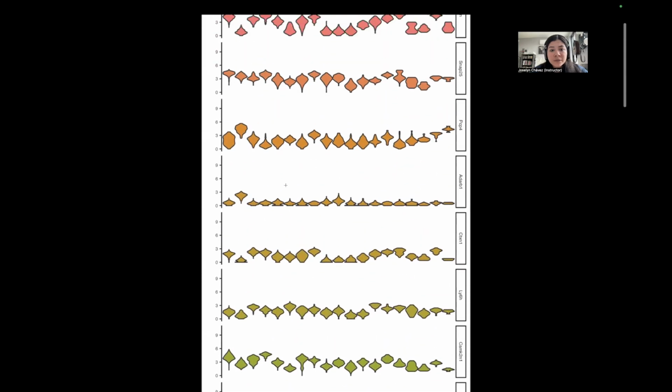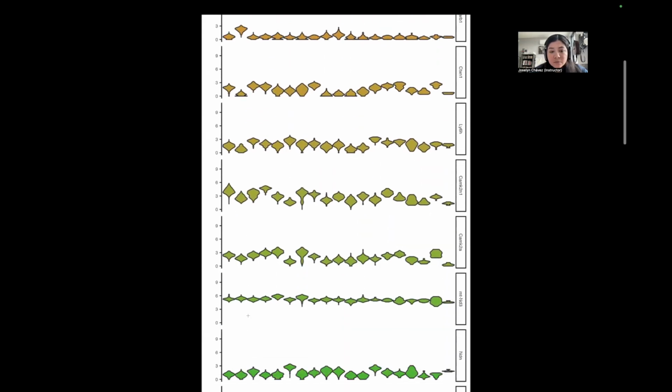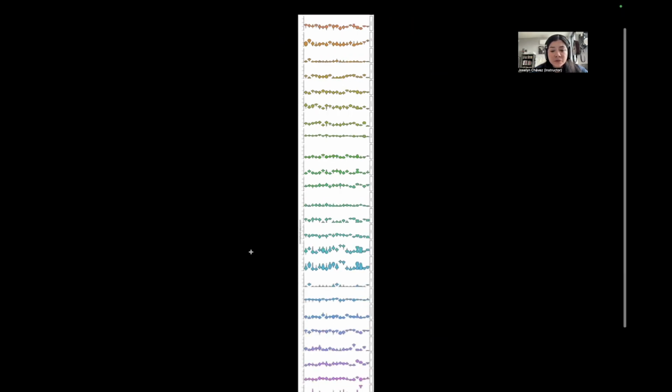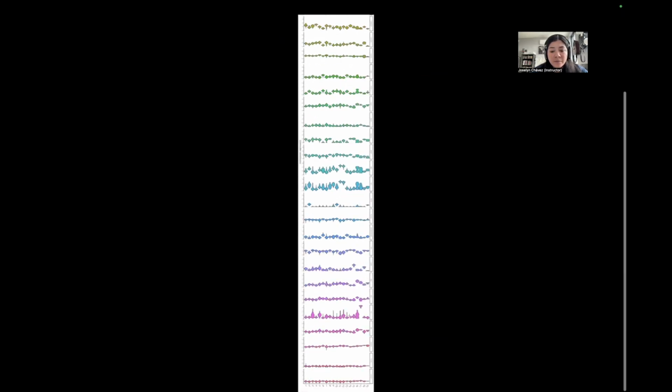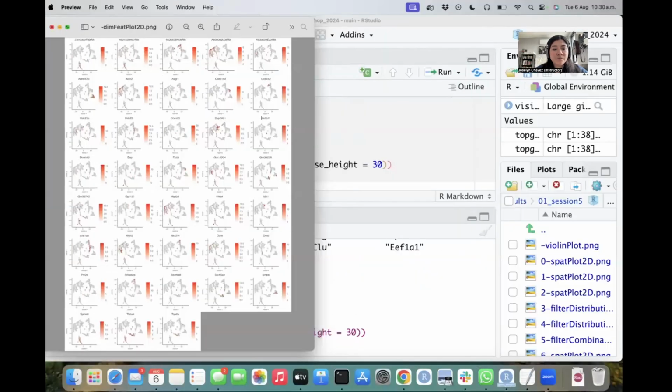Then let's see what else we have over here. Well, here we have a more diverse behavior. Oh, this one is more particularly from the cluster 2, and so on. Well, you can analyze these results with more time, but the basic idea is basically comparing again the expression levels of these genes between the different clusters.